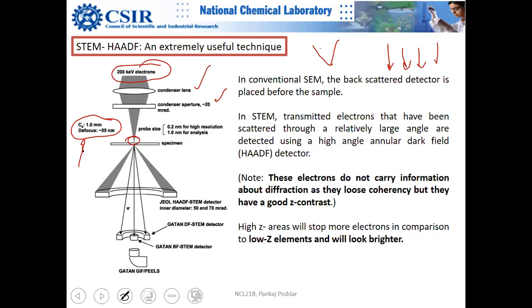What is the reason that you need to defocus? In electron microscopy, you get a high quality image when your defocus is proper. If you focus properly, you will not get an image, because of CS. There is an aberration, and the aberration is counterbalanced to some extent by this defocus, because there are other problems also.